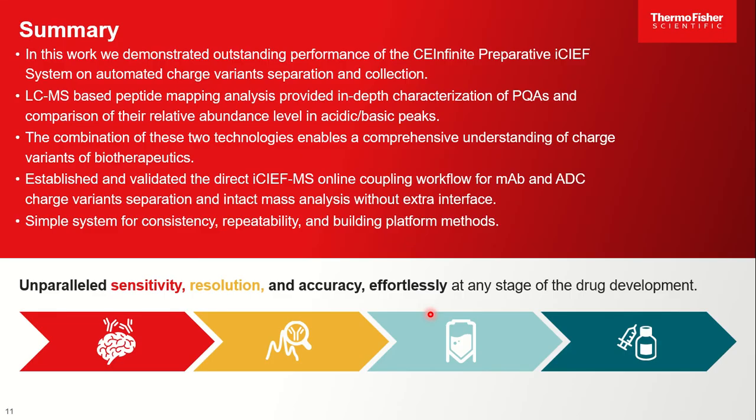Okay, let me summarize my contents today. In this work, we established and validated both iCIEF offline preparative and online mass coupling workflow.